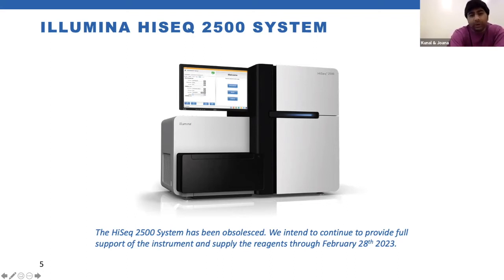So now they've been decommissioned by numerous places, including here at the Genome Center. We have a bunch of them upstairs that are just collecting dust and are now even available on eBay to buy. So instead of just letting them collect dust, we thought it'd be cool to see what's inside and see if we can make it a useful instrument again.